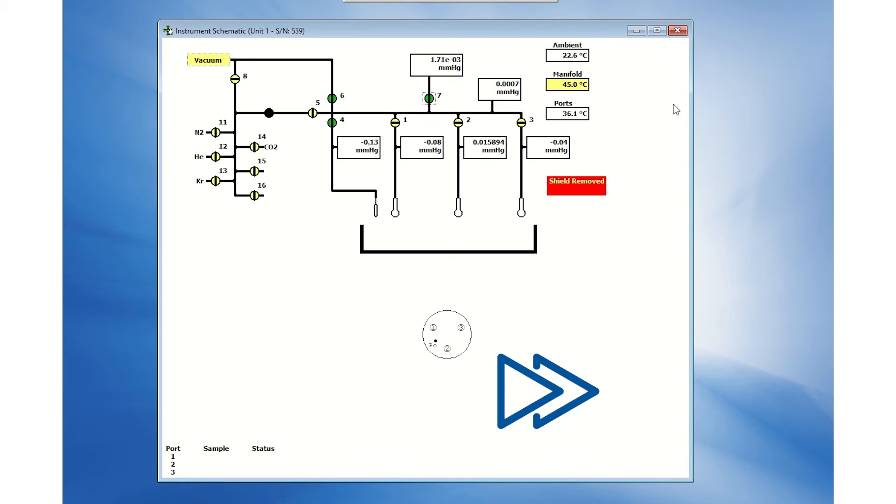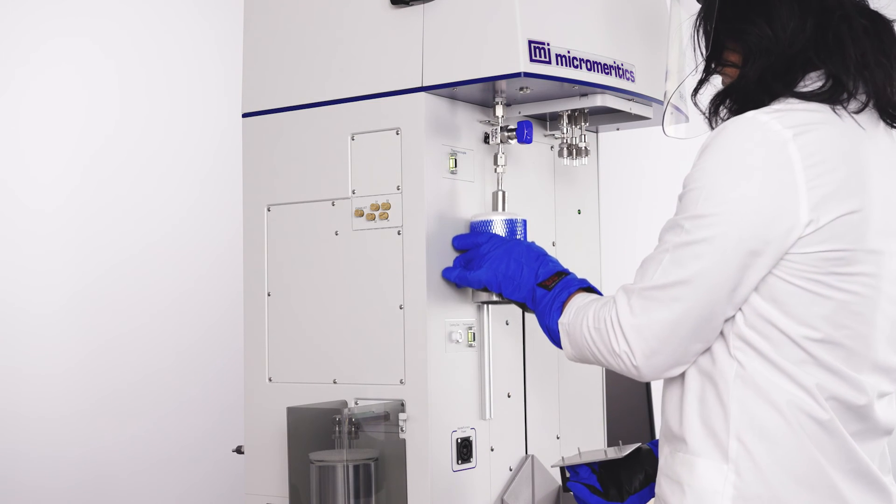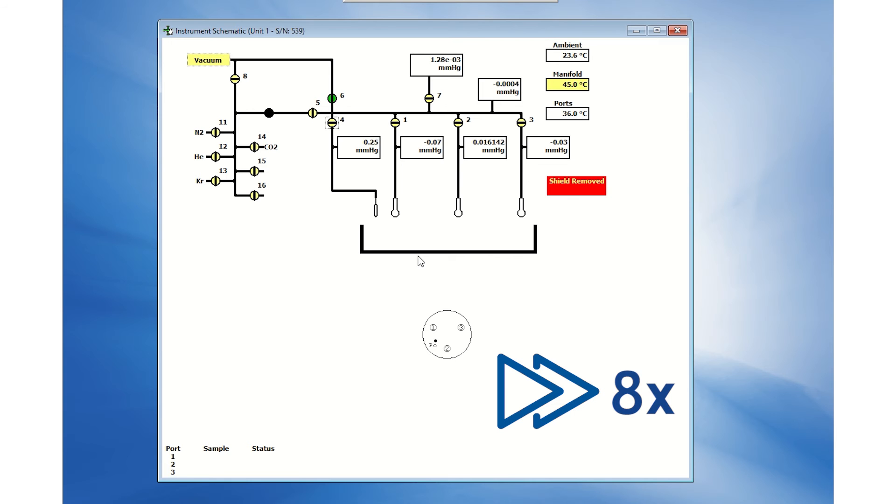Once the pressure stabilizes, close valve 4 and 7 on the schematic and remove the cryogen bath. Let the reservoir thaw. A gradual increase in pressure on the schematic indicates the vapor thawing.